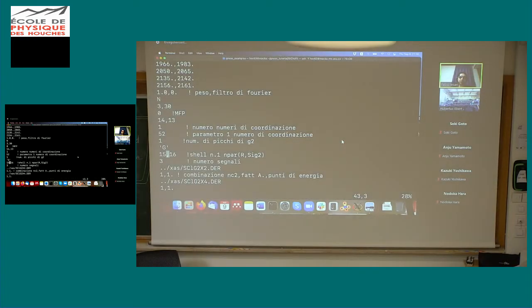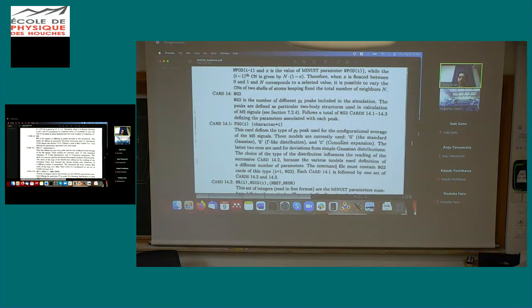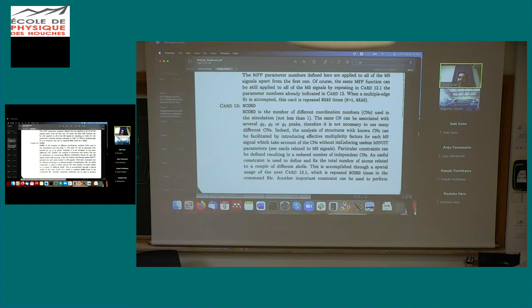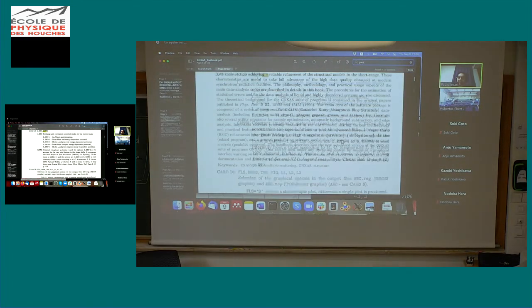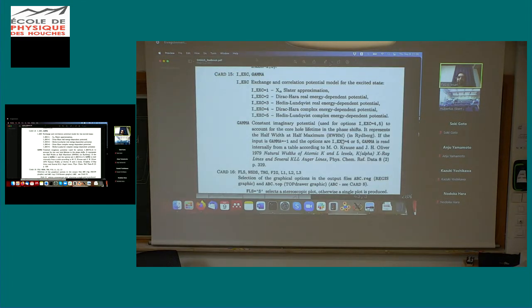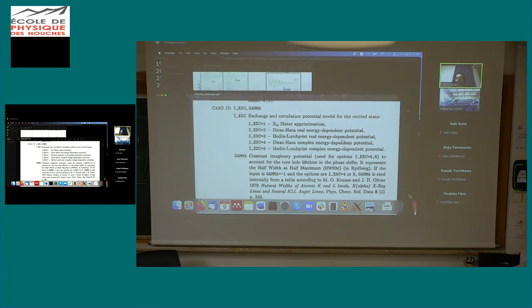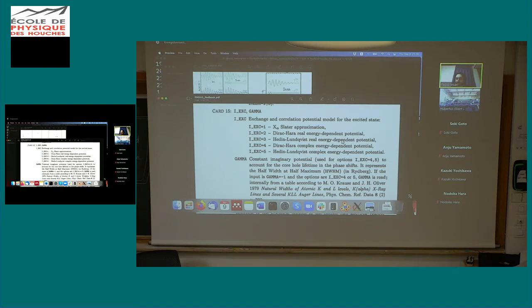So for Gaussian, we need two parameters, which are... Fabio? Yeah. By asymmetric kind of Gaussian, do you actually mean it's a Gaussian Lorentzian convolution? Basically, do you mean a Voigt function here? I don't remember. I think the function is written somewhere in the manual. I see. Okay. So in that case, we have... Wait, maybe I will find it.